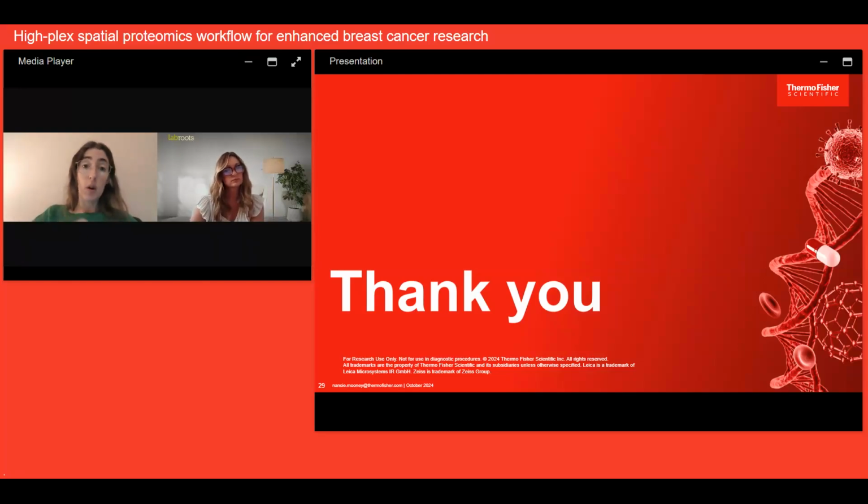If you're going to be using the Alora dyes on something like an EVOS M7000 that's actually got more of the cube-based filters, all of those match to pretty standard fluors. So like Alora 488, you use the GFP filter, and so forth. And that is all in not only the Alora user guide, but I think we also will have that in Spectral Viewer and some of the other helpful guides in terms of how to match filters to the various fluors.